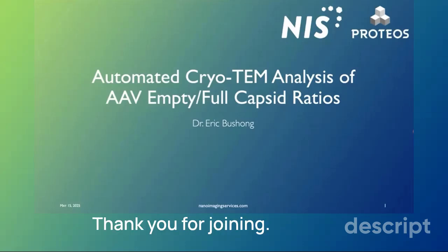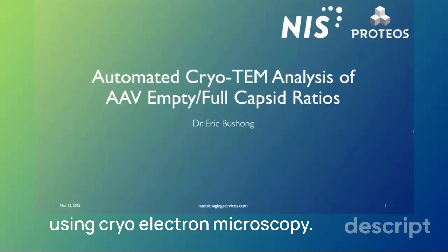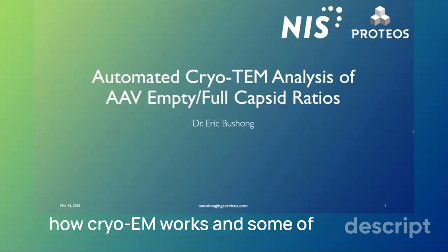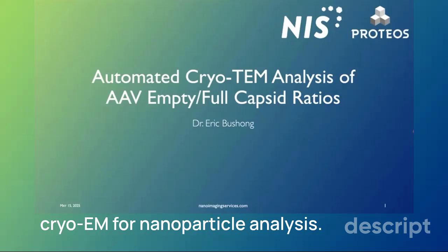Hello, thank you for joining. The main focus of this talk today will be on AAV empty-full analysis using cryo-electron microscopy. Before going into that in detail, I'll begin with a brief introduction to how cryo-EM works and some of the general advantages to using cryo-EM for nanoparticle analysis.